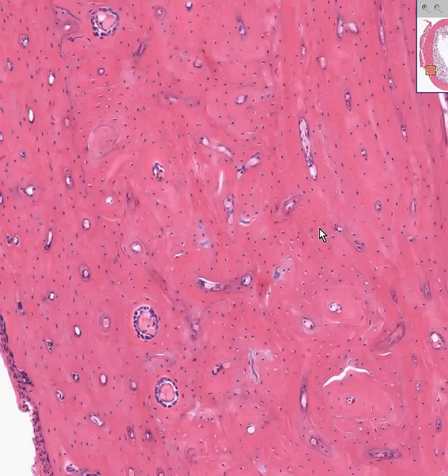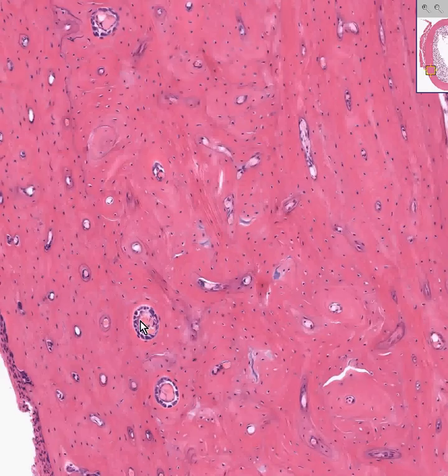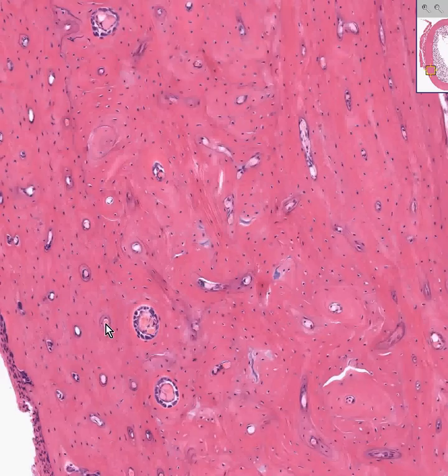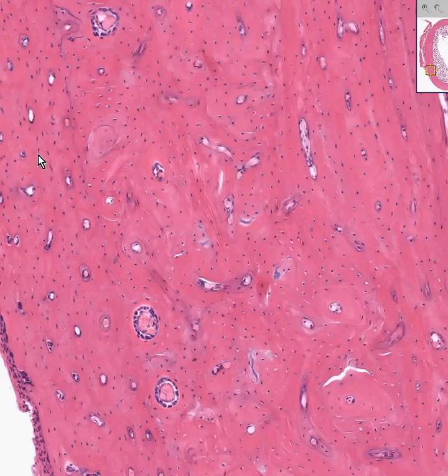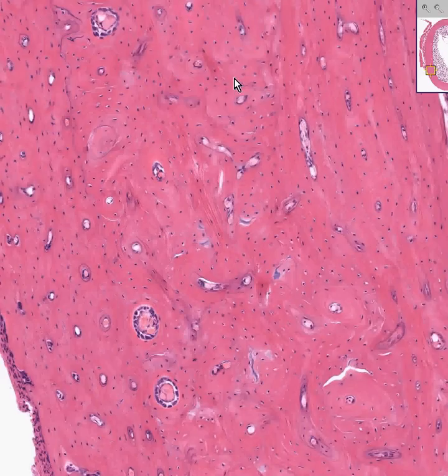The dense cortical bone itself has these little circular spaces which are called Haversian canals, because they form the units of bone formation — the Haversian units — in which the central holes deliver nutrients via blood vessels. Growing around them in a concentric and lamellar fashion are your osteocytes. Almost all of the longitudinal canals you see here, surrounded by these concentric osteocytes, are Haversian canals.